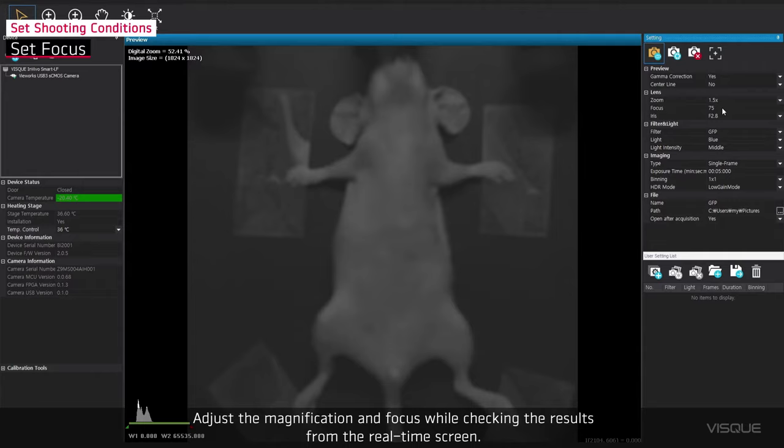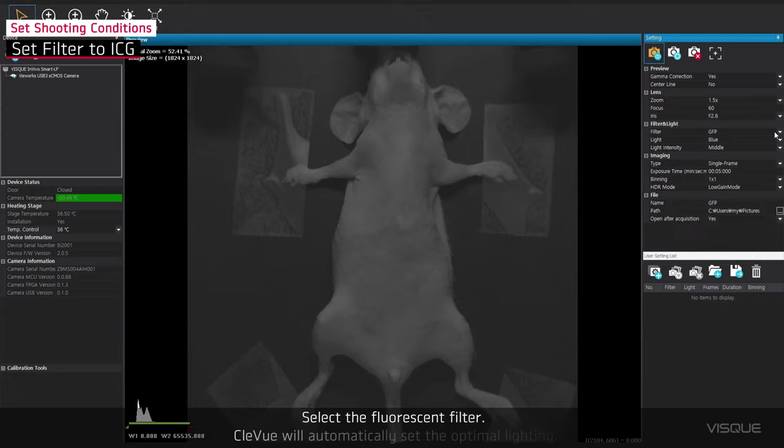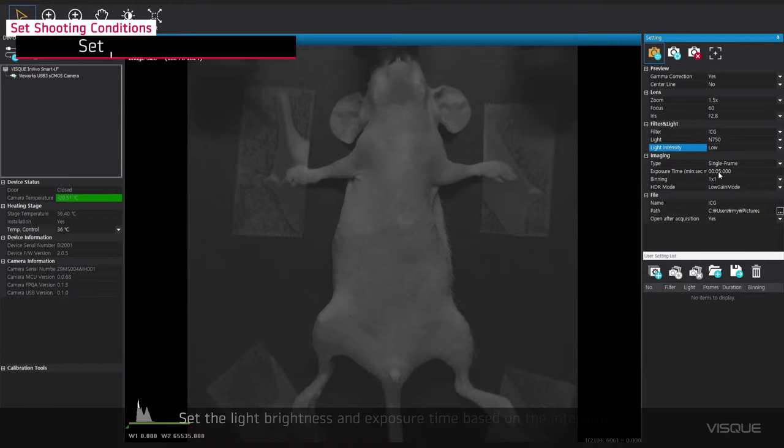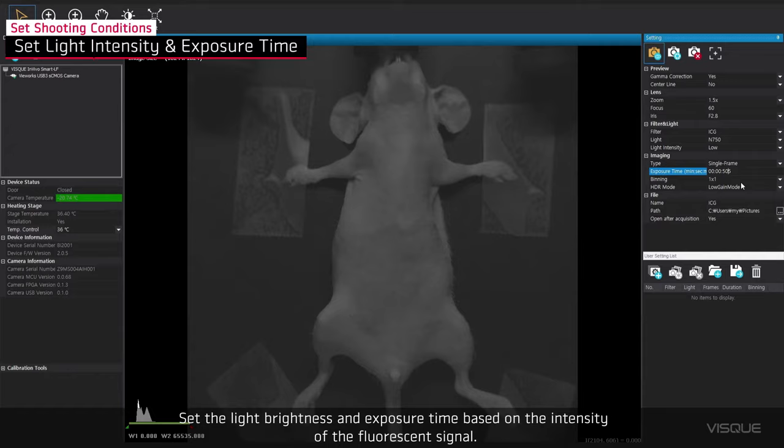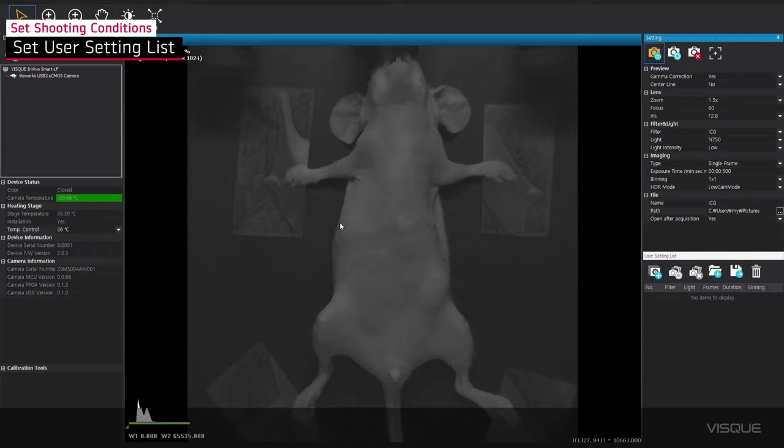Select the Fluorescent filter. CleVue will automatically set the optimal lighting. Set the light brightness and exposure time based on the intensity of the Fluorescent signal. The video file is automatically saved. You can change the saving location from File Path. You can add a shooting setting for the User Setting List window if needed.